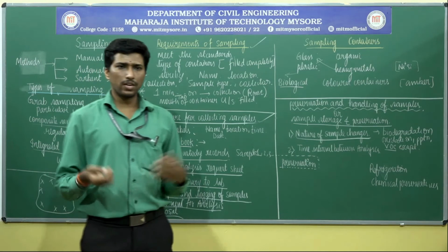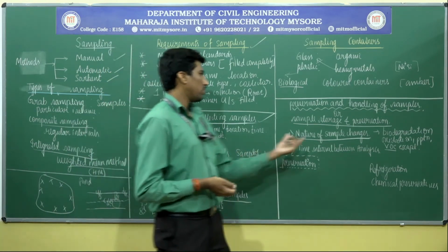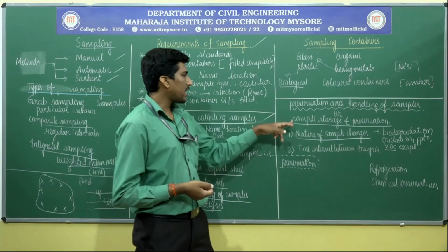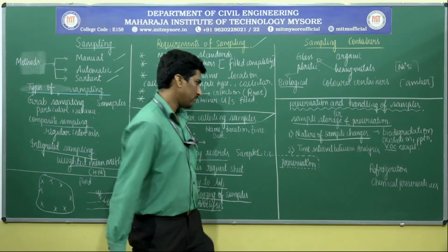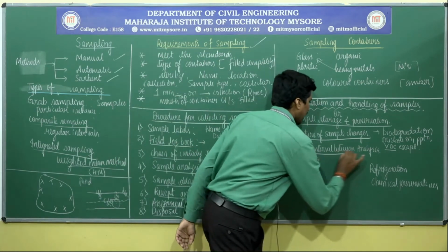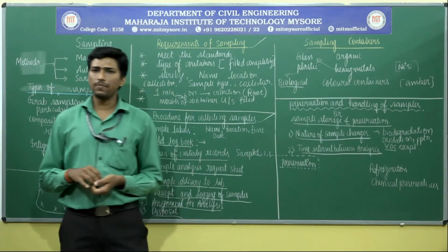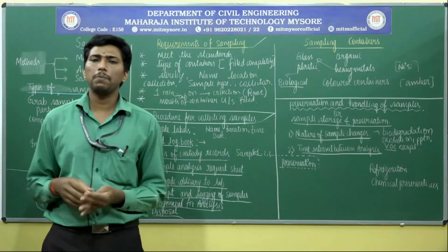That analysis also you can do if you have a clinical observation in this; you can determine the nature of the sample. Mainly the storage and preservation depends upon this. And as I have mentioned, the time interval between the analyses has to be a short time interval. It should not be a long time interval.